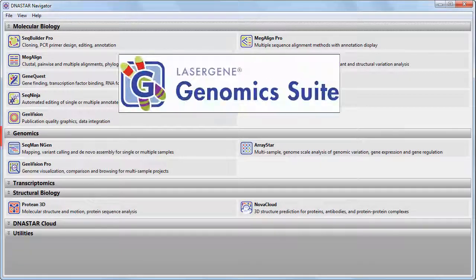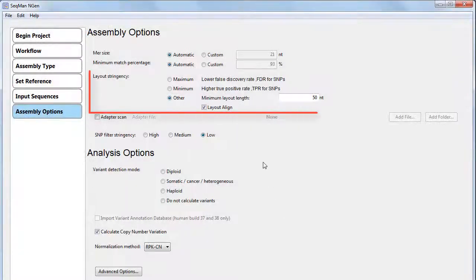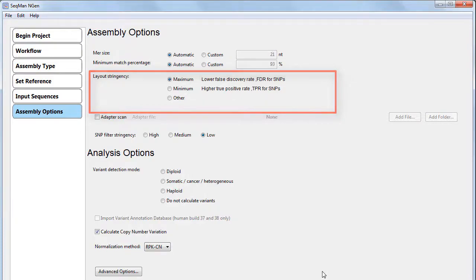In the Genomics Suite, SeqMan NGen has a new option to further fine-tune our already extremely accurate variant detection method by adding a new enhanced read mapping option for whole genome alignments. This option lets you choose between using rapid variant detection parameters during assembly, or performing a slightly slower assembly that dramatically reduces the detection of false positives identified during SNP calling.